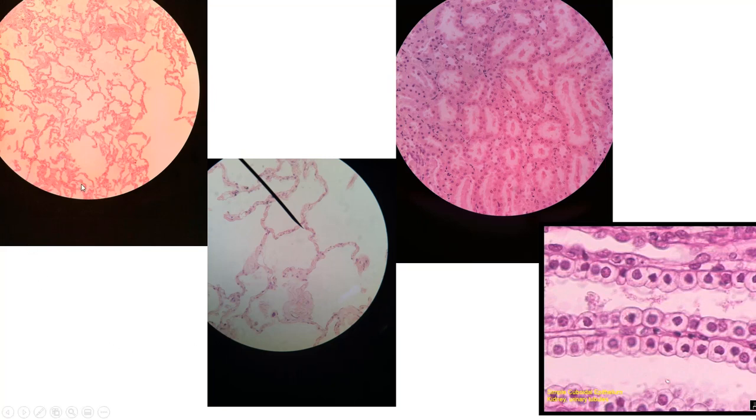So microscope slides that you're going to draw for the tissue drawings include these. So this is the lung right here, this slide and this slide. So this is simple squamous epithelium. And basically what you're looking at is the lining of the air sacs of the lungs.